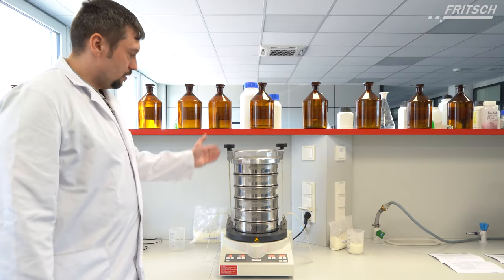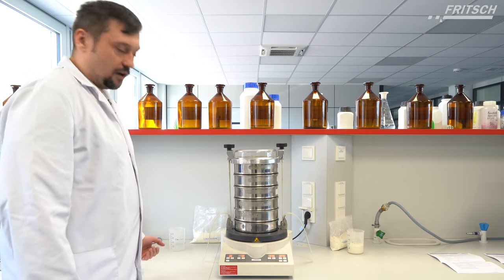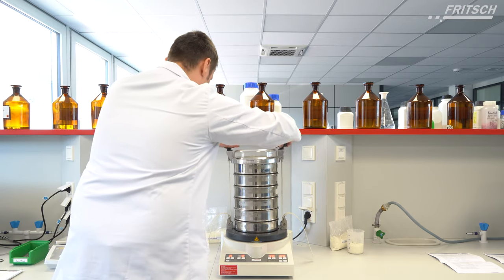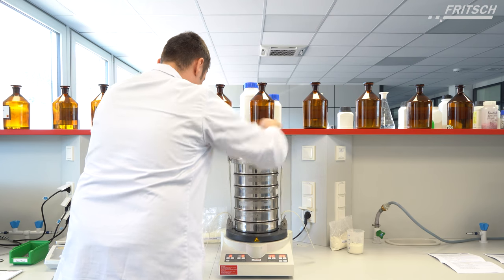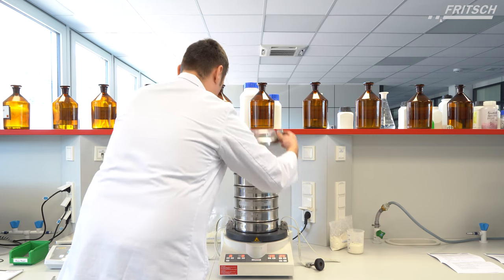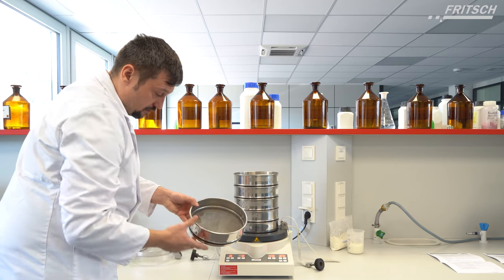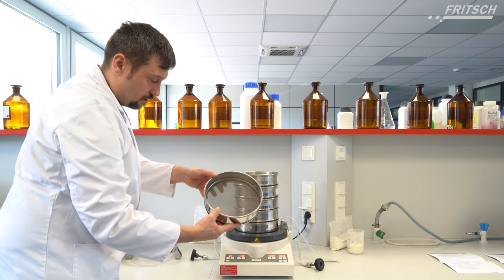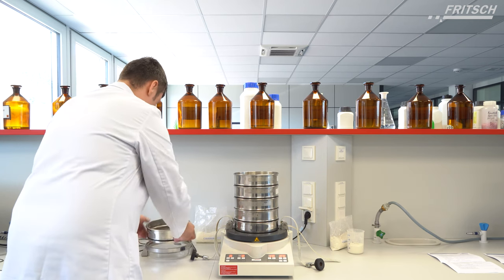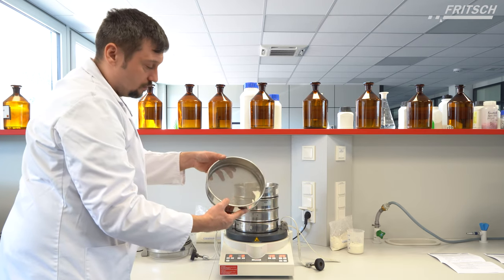After the sieving test we open the sieve stack and take a look to confirm the sieving procedure is completed. The first sieve does not include a lot of sample. The next one is a little bit more tricky.